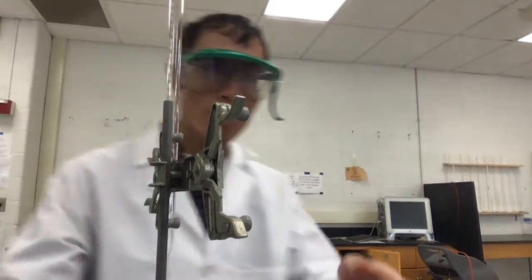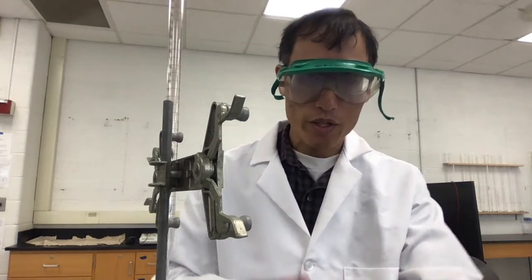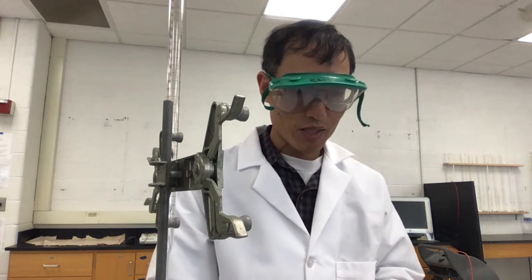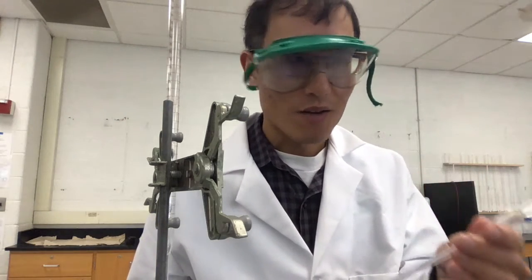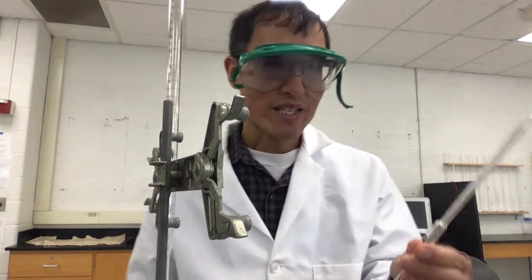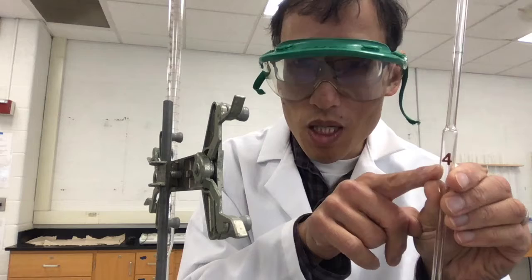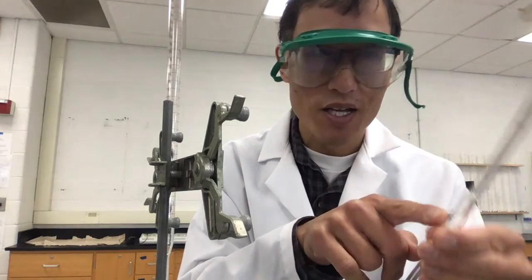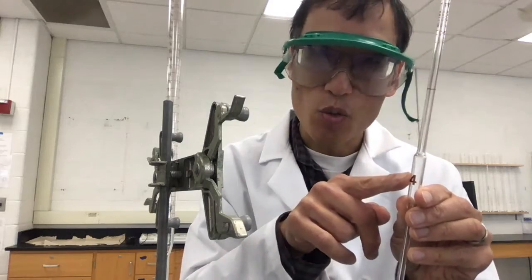So the way that we measure things when we do exact measurements, in the simulation they use something called a volumetric pipet. Anything that's volumetric. So this one, for instance, let me give you an example, is a 4 milliliter volumetric pipette. There's no marks on it at all. The marks are called graduations.